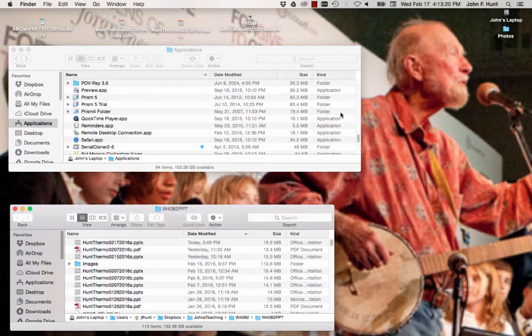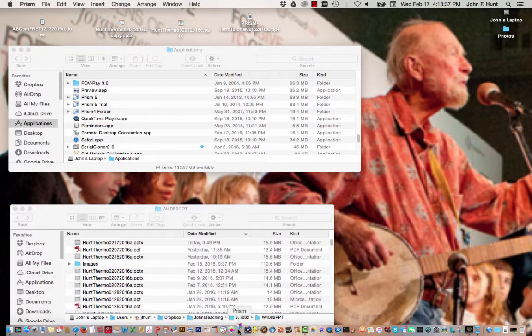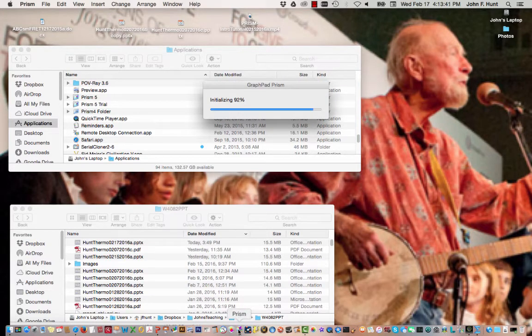Okay, the purpose of this screencast is to introduce you to slightly more advanced features in PRISM, and especially some of the nuts and bolts involved in doing curve fitting analysis. So I will start up PRISM. And while that's going on, I will note that what we're going to do is simulate some data. We're going to add noise to it. The previous screencast did something like this.